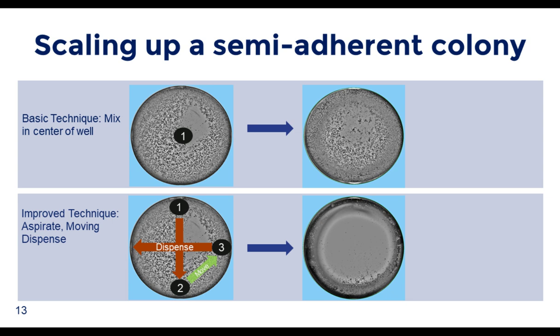As we incorporate new plate types and translate to automation, we face converting manual semi-adherent colony transfer to an automated liquid handler method. Manually, this involves pipetting up and down while moving the tip across the bottom of the well, then tipping the plate to aspirate. A basic liquid handling technique of briefly mixing only in the center of the well transfers limited cells. Solutions include multiple mixes for small wells like those in 384-well plates, though excessive aspiration or dispense speed — or excessive mixes — could affect cell health.